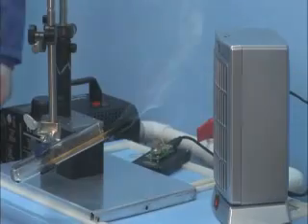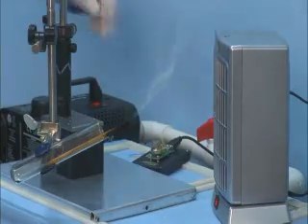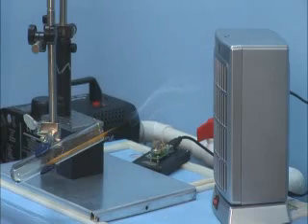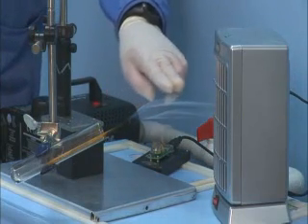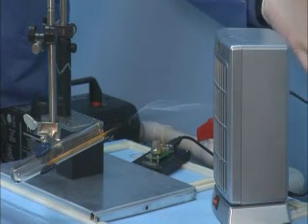For this experiment, we will show you how well the ChemStop draws in contaminated air. I will turn on the ChemStop machine now. Notice how the smoke source is being drawn into the device, and all the returned air is clean and clear.